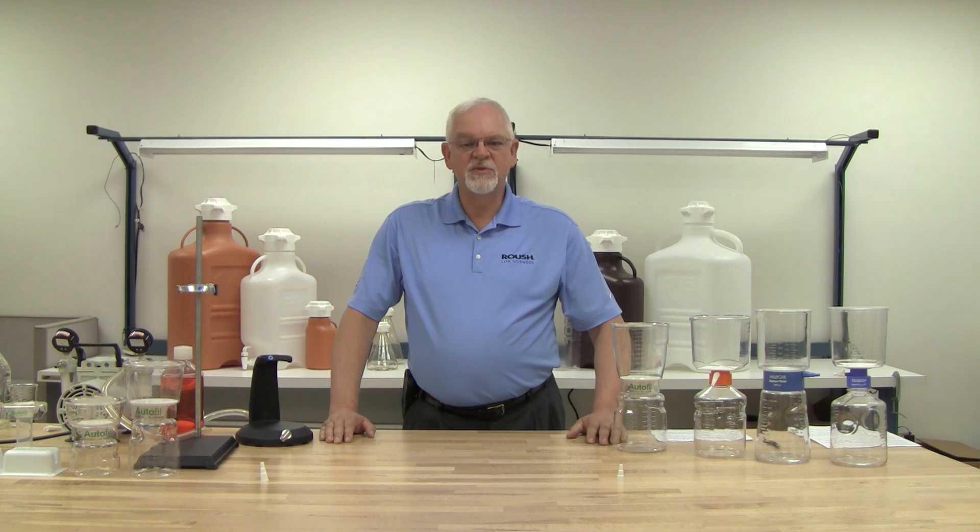Hello, this is Steven Moreau from Roush Life Sciences. I'm here today to introduce you to our new benchtop filtration line called Autofil.